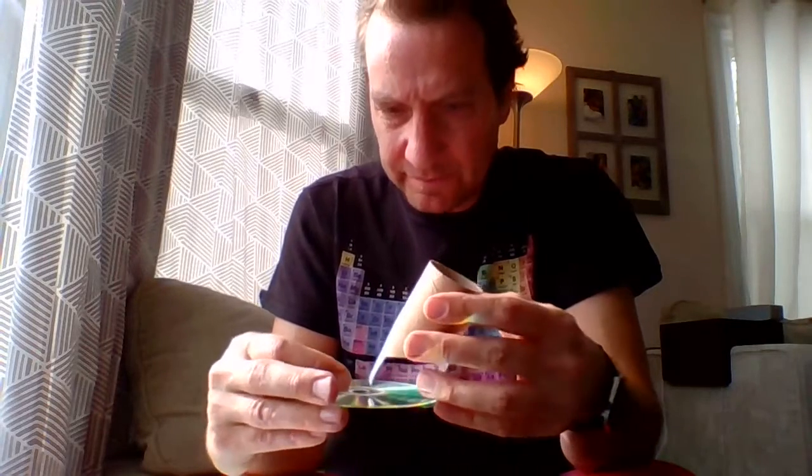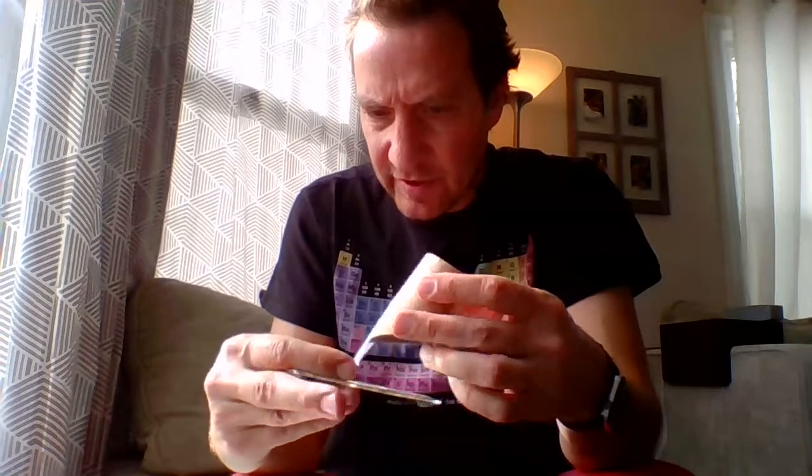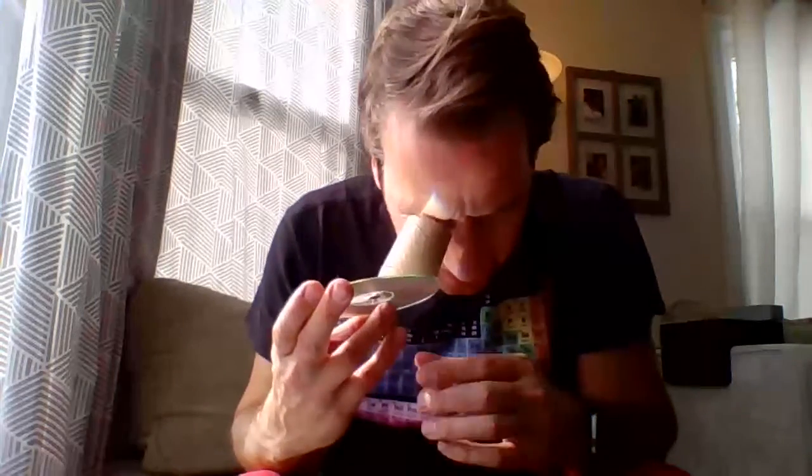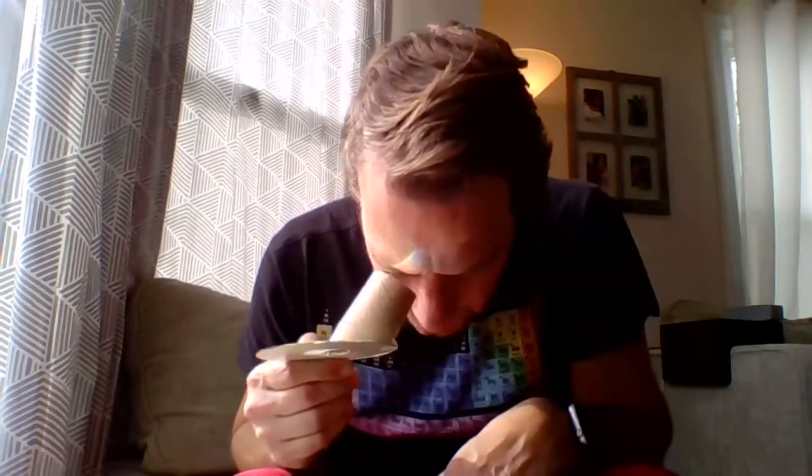I want to line this up so I can get most of the CD within the tube. I'll position it so the tip is almost right in the center of the CD hole, and then I've got the other end taped down here. Now this thing is nice and stable — I can look through it without using my other hand.